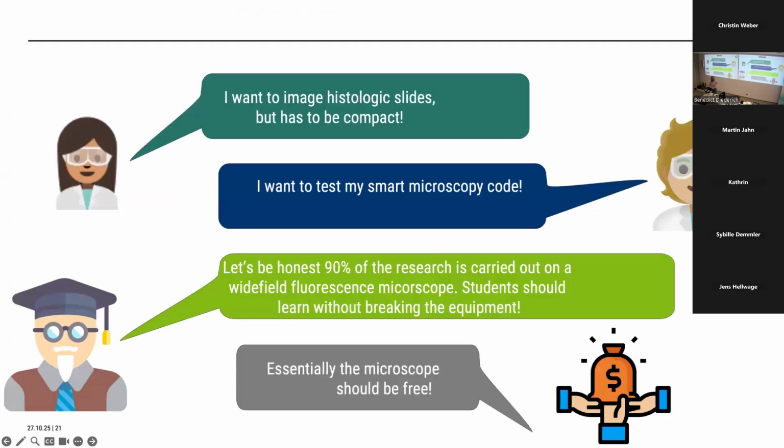And very often you have this situation, I think also here in this building, where maybe the PI is a bit frugal. He or she doesn't want to spend so much money on buying a new microscope. Also, you have the problem, if you have a PhD student and the person is leaving, all the knowledge is lost. So if you build a microscope on the optical table, who is actually maintaining that once the person is finished? So there are different people with different interests, and eventually you need to have a system that is somewhat standardized, like our cubes, but is also professional.